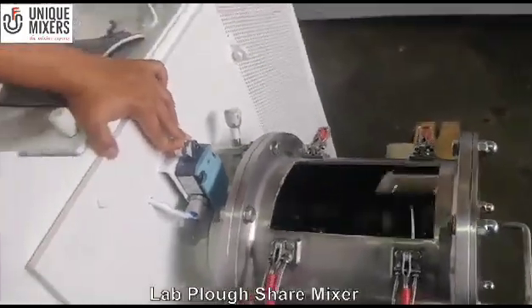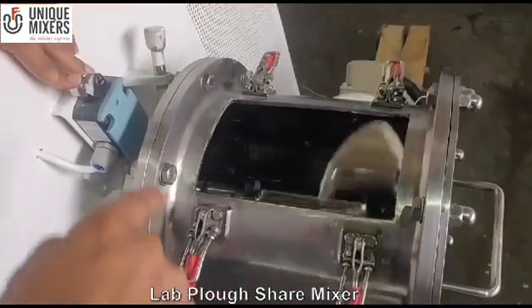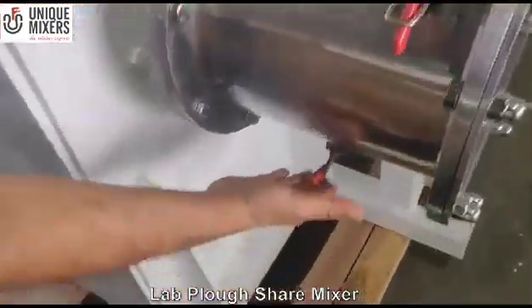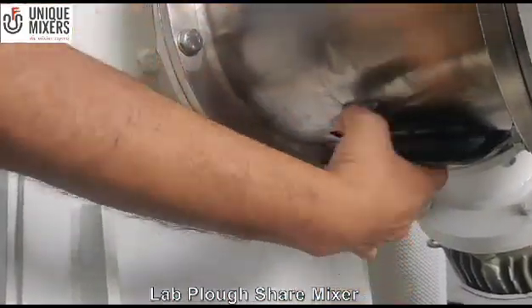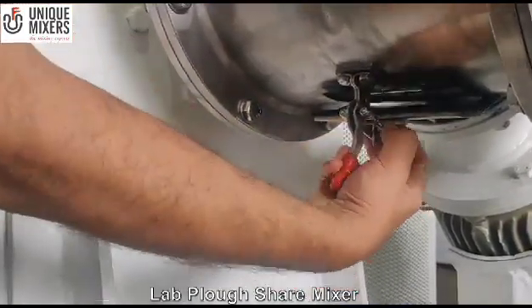Quick blend times — maybe less than 5 minutes — and easy to discharge. There is an opening at the bottom. As you can see, there is a bottom handle and it is flush. I open this and I can discharge the material from here. Very easy.